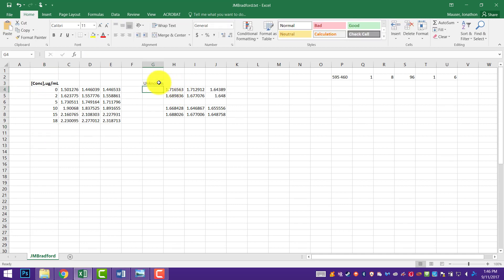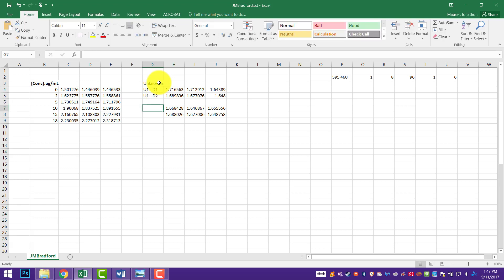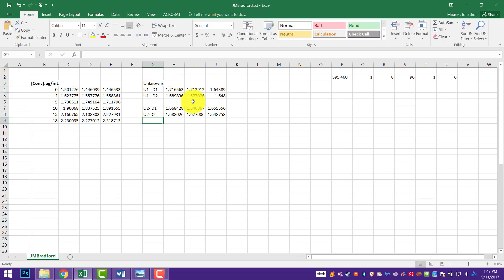This is unknown 1, dilution 1; unknown 1, dilution 2. And this is unknown 2, dilution 1, and unknown 2, dilution 2. So that's just keeping us straight on where we're supposed to be on this thing.